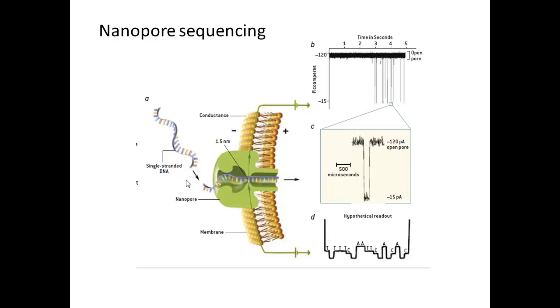We conclude with a discussion of one of the potentially most exciting methods, and that is called nanopore or electrophoretic sequencing. And here we have a lipid bilayer, we have a channel molecule which actually imports DNA into the cell, single-stranded DNA. Because the 4 bases are different sizes, as an individual base goes through this narrow pinch point region, it's going to restrict or allow the flow of different amounts of accompanying ions like sodium or chloride or any of those. And there's going to hopefully be a characteristic signature in terms of how many different ions can pass through when a different base is passing through here.